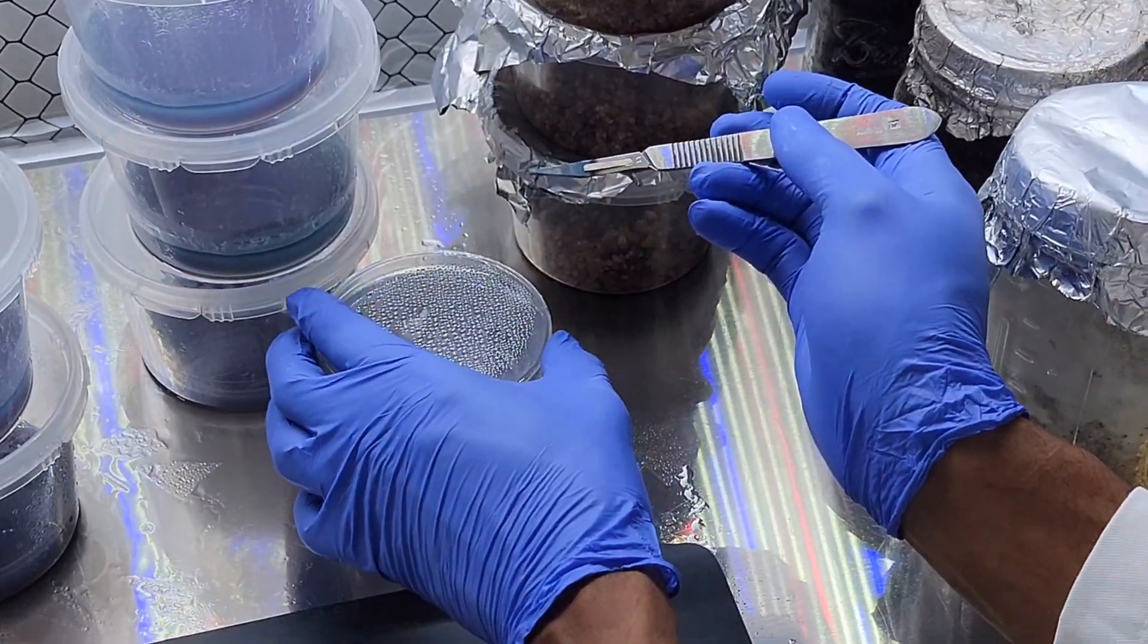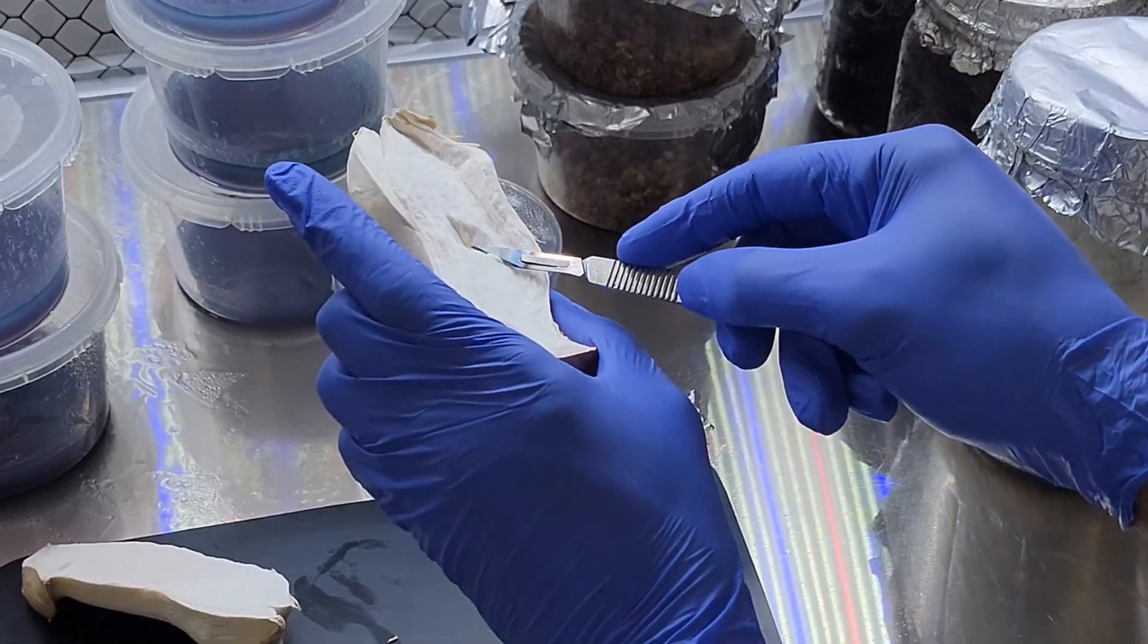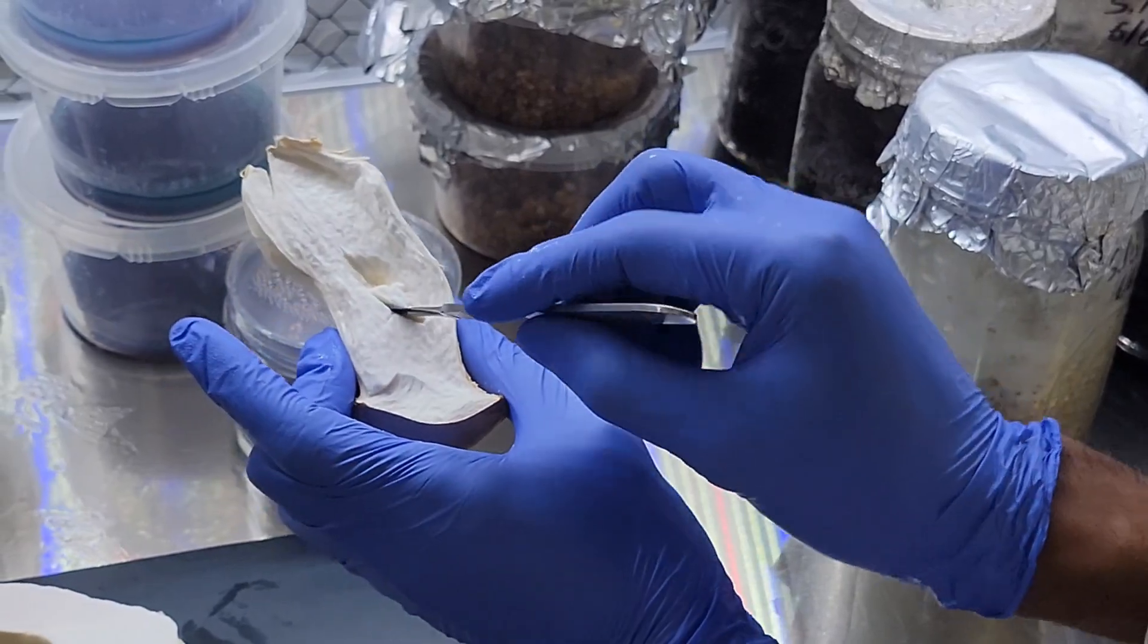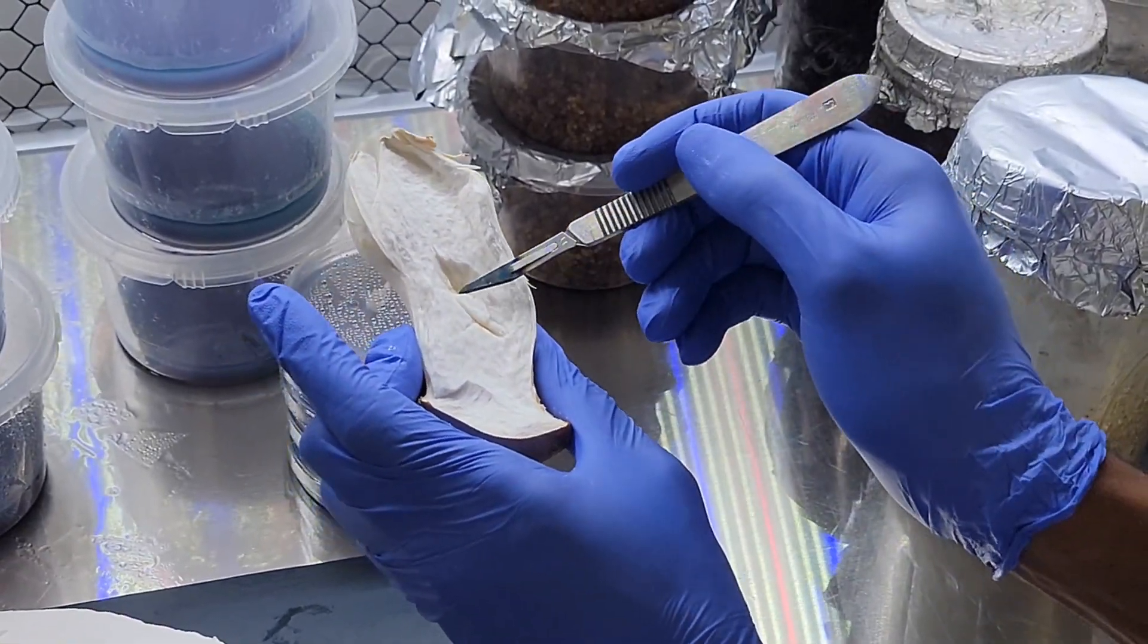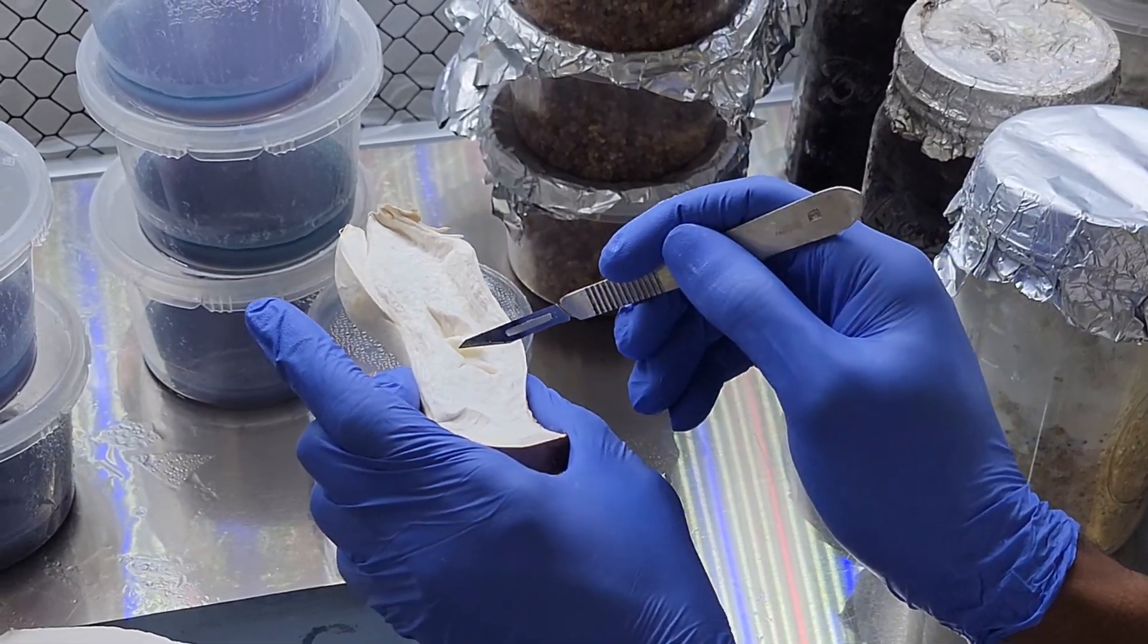This will not always be the case for fungi such as Trametes versicolor, also known as turkey tail - it's very thin. So sometimes you might have to put the whole specimen onto agar, which is totally fine. You'll just have to isolate the contamination away through multiple transfers.